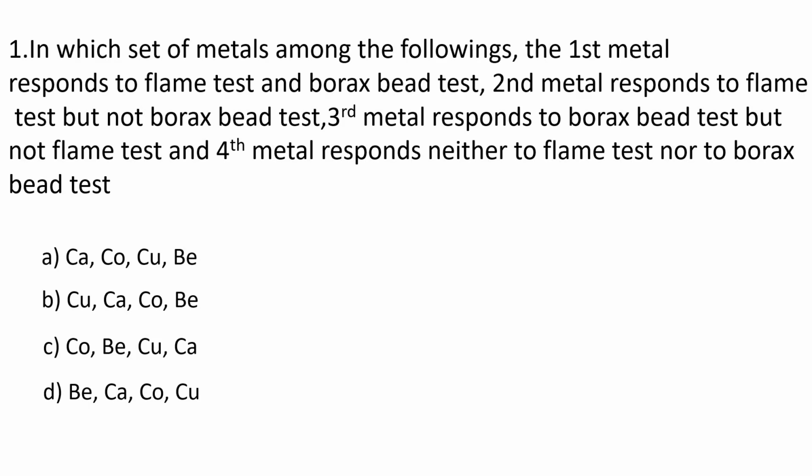Multiple choice question number 1. In which set of metals among the followings the first metal responds to flame test and borax bead test, second metal responds to flame test but not borax bead test, third metal responds to borax bead test but not flame test, and fourth metal responds neither to flame test nor to borax bead test.